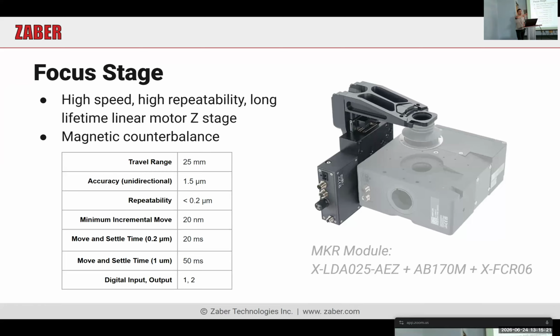So now I'm going to keep talking about just the individual modules, the basic modules. I'm going to go through these fairly quickly, just to give you an idea of what the standard parts are. So when we get to the next stage and start talking about some of the really cool things we can do to enable interesting systems, these are the foundation of that.